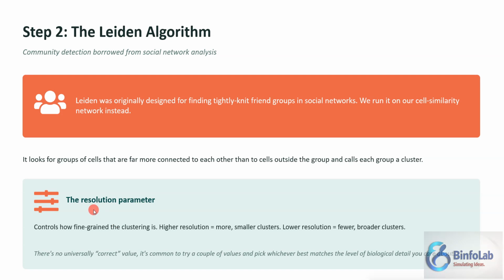Now, what's the resolution parameter? This parameter controls how fine-grained the clustering is, how superficial or deep the clustering is. High resolution will always mean more, smaller clusters. Low resolution will always mean fewer but broader clusters. There is no universal correct value.